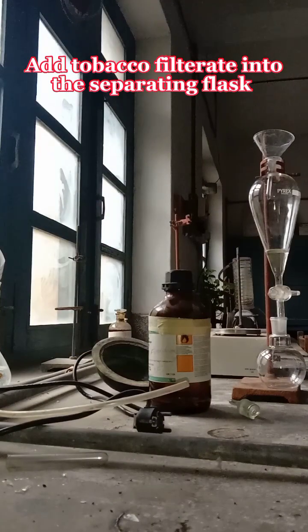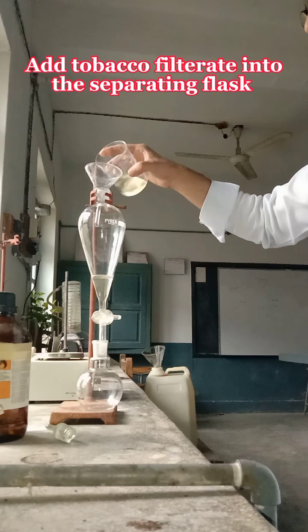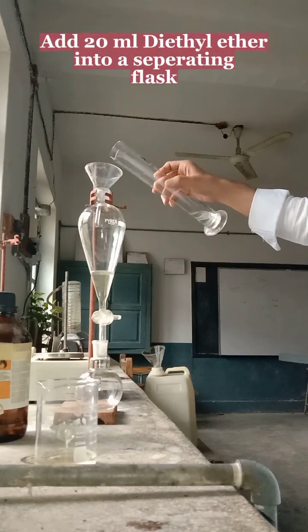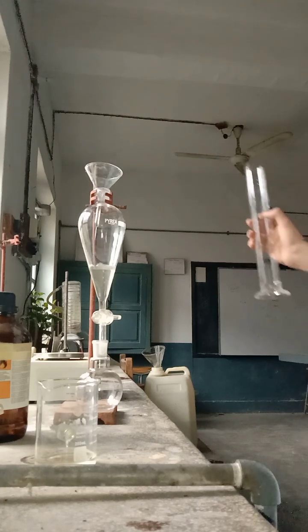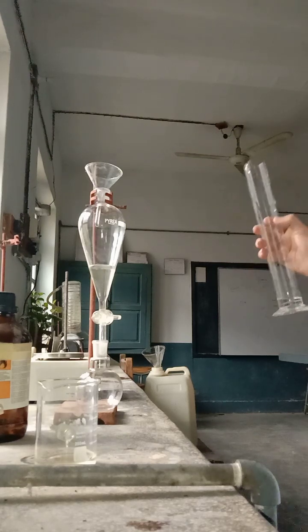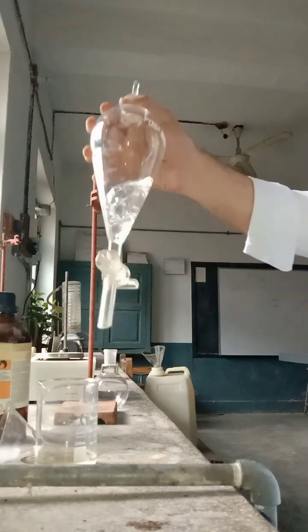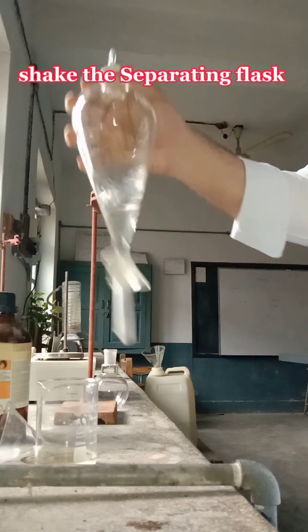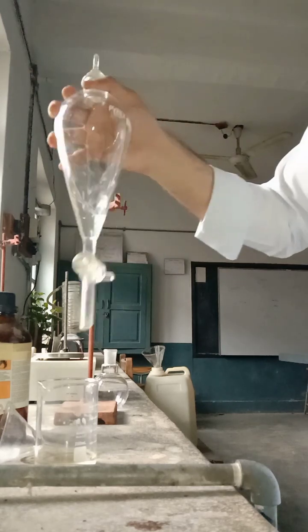We take the tobacco filtrate, then add 20 ml of diethyl ether into the separating flask which already contains the tobacco filtrate. Two layers form — we shake the separating flask properly so proper mixing can occur.